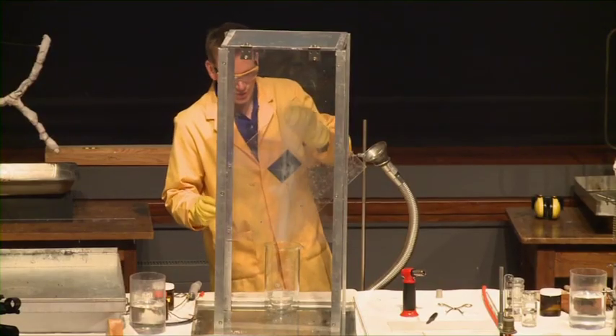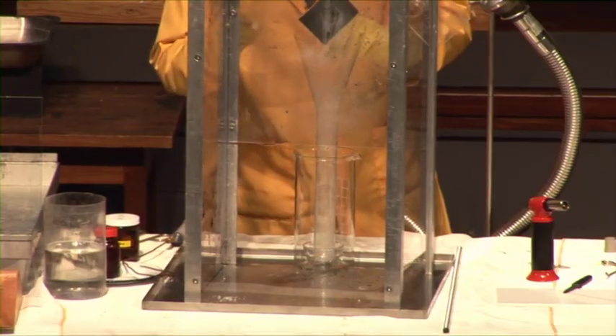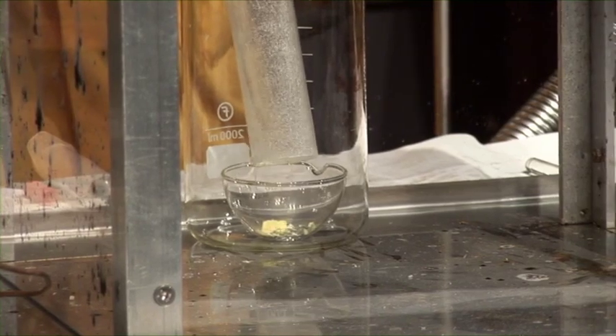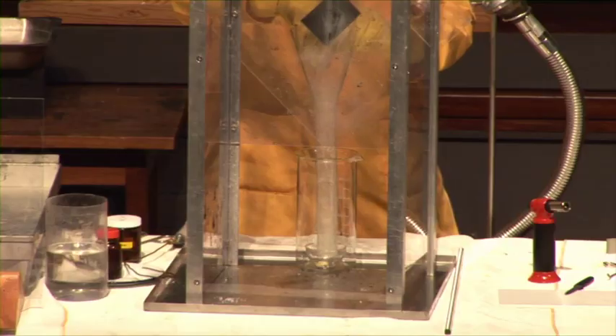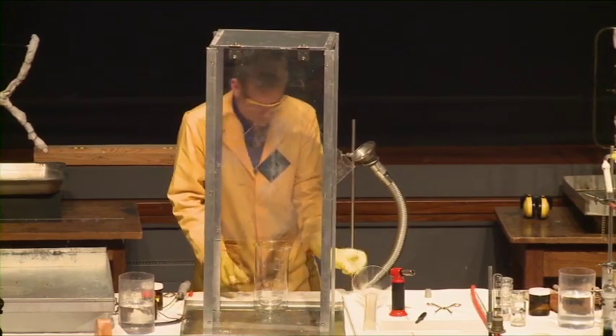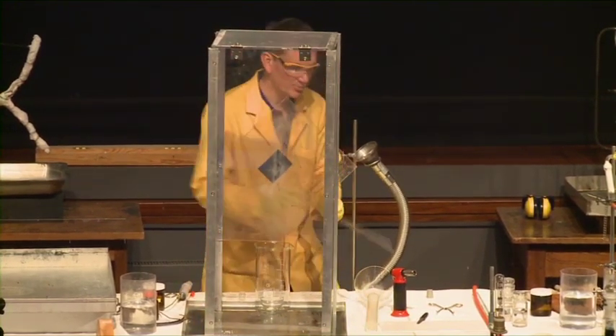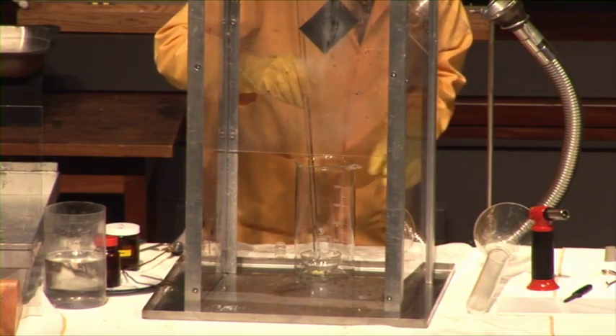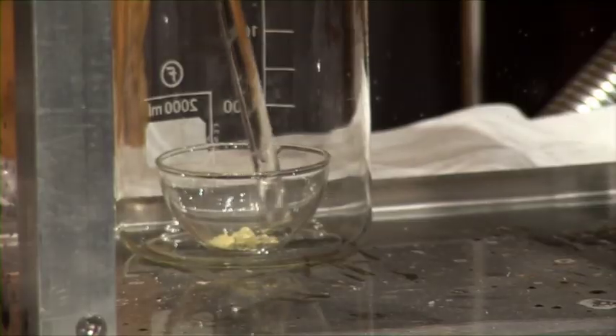This is the potassium superoxide — the yellow potassium superoxide — added to the lithium. I'll just give this a bit of a stir, just to make sure they're all nicely mixed up together.